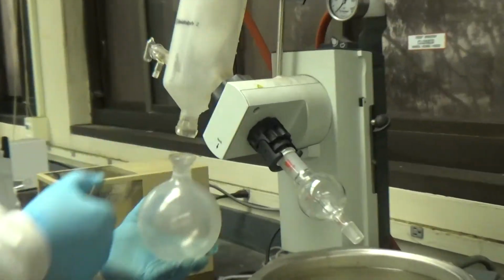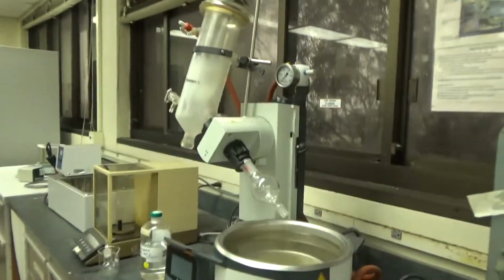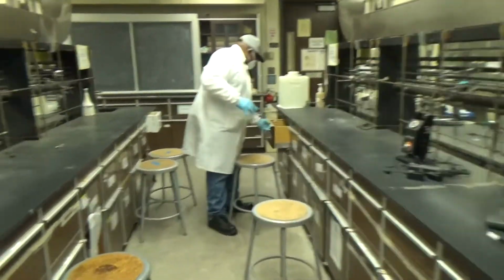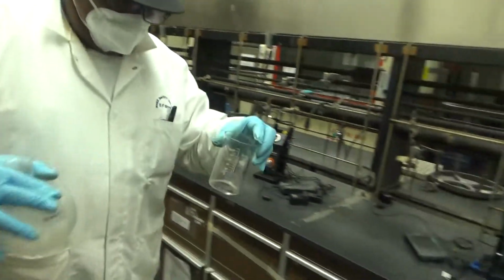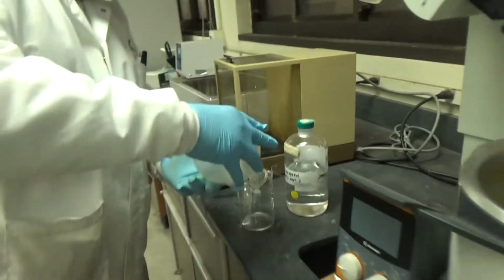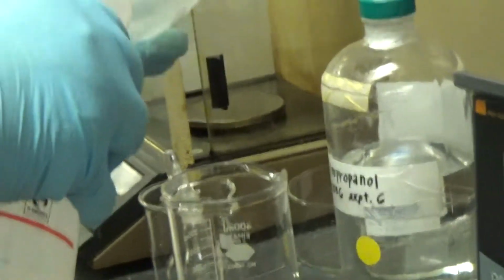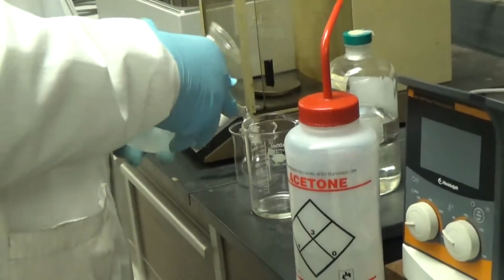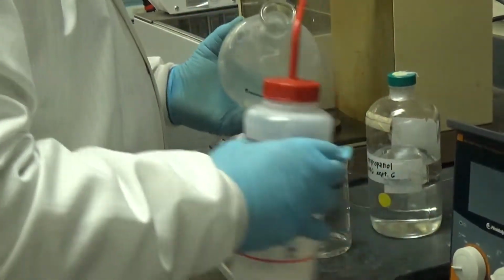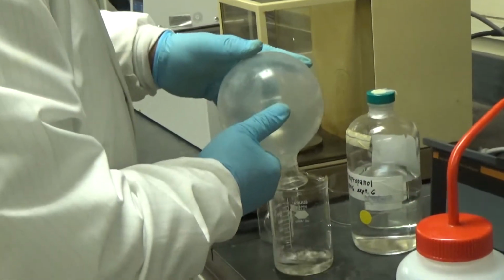Then you take off the receiving flask. You get a beaker. So that's the dichloromethane, methylene chloride waste. You empty the receiving flask. Take some acetone and rinse the receiving flask with acetone. Do that twice. Okay, now it's clean.